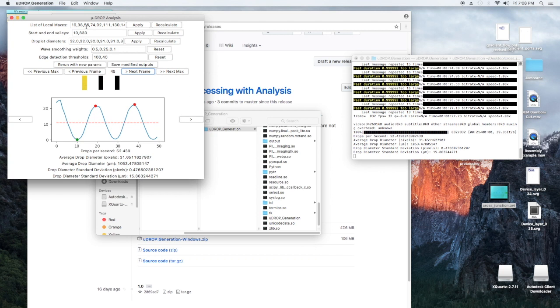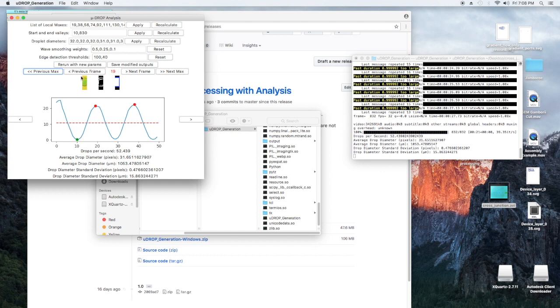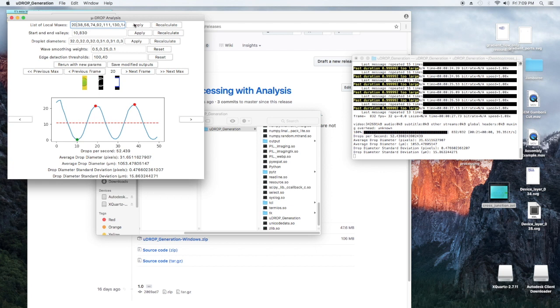Sometimes it messes up, so to fix that, let's say right here, we'll go to frame 19. So this is frame 19, and let's say we decided that frame 20 is actually a better representation. Frame 19 is too early, so we want to do it at frame 20. Well, that's okay, we can change our local max to 20 over here and hit apply, and that'll shift this over 1. So this is the max that we're working with.